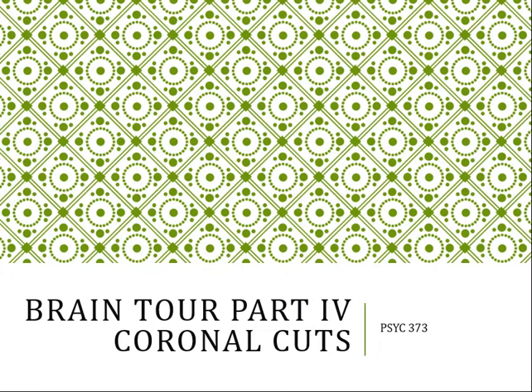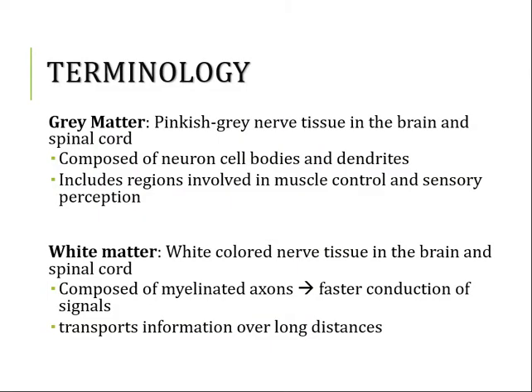This week we're going to talk about our fourth brain tour, which are the coronal dissection cuts. So let's get started.